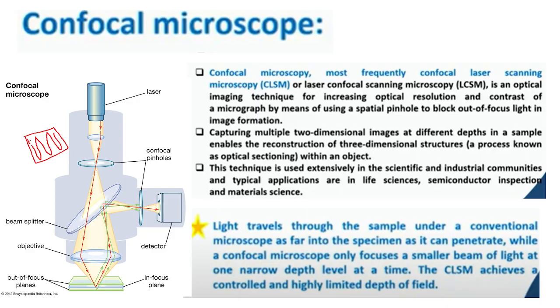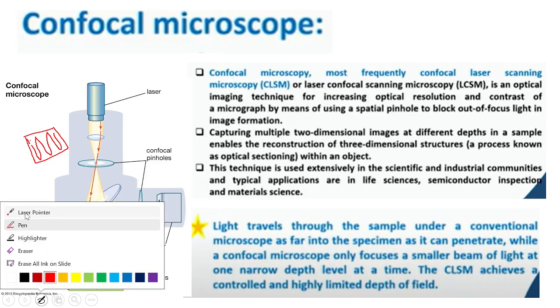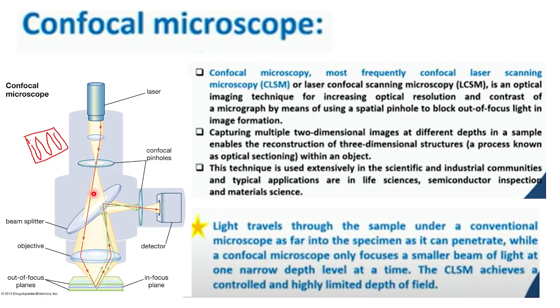So here you need a special pinhole. And why do I need a pinhole? To make a pinpointed radiation. And capturing multiple two-dimensional images at different depths in a sample enables us to reconstruct a three-dimensional structure as an optical section.